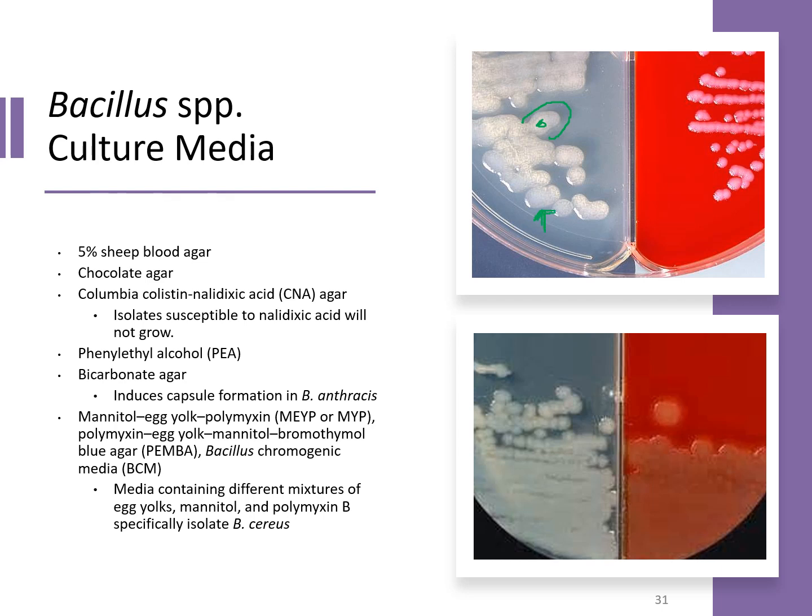Down here is a good example of that watery look. And so with this, if you get this appearance, you could suspect that you're dealing with anthrax, whereas this is definitely not anthrax. You don't see that mucoid look. You can see the difference of the appearance on the blood agar over here for both of these. So you can still see that kind of straightforward look here.